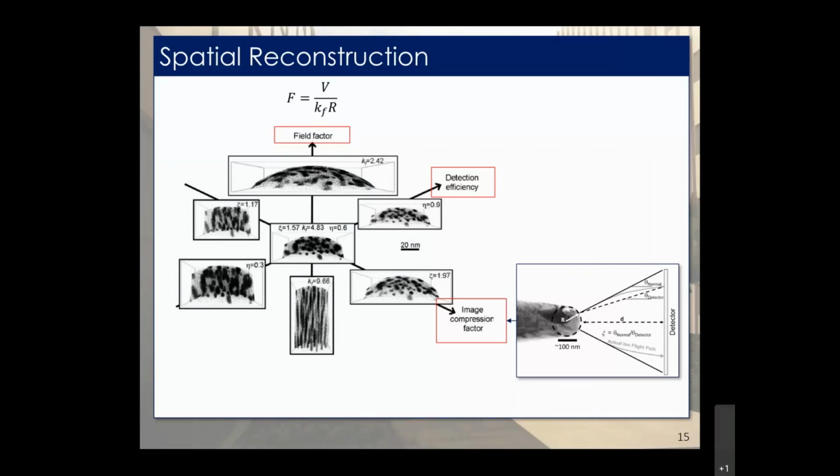Like if you wanted the radius of these precipitates, then you would have to get a reconstruction you can trust spatially a lot more. So part of the whole process in reconstructing atom probe data and then doing the subsequent analysis is knowing how far you can take the analysis, given how well you've been able to do a reconstruction and how much you can trust the final material model that you build.